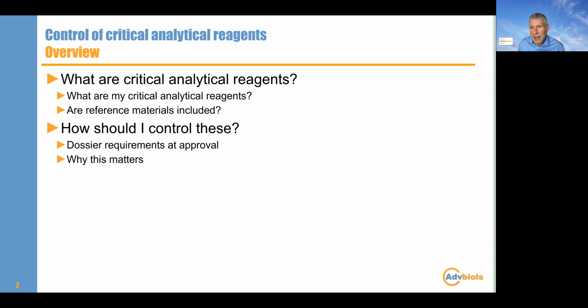Okay, so I think the point to remember is that your analytical methods are just as important to your product as, say, your raw materials. And the performance of those analytical methods is also highly dependent on the quality of the reagents that you're using. And this is the point to this talk, really.